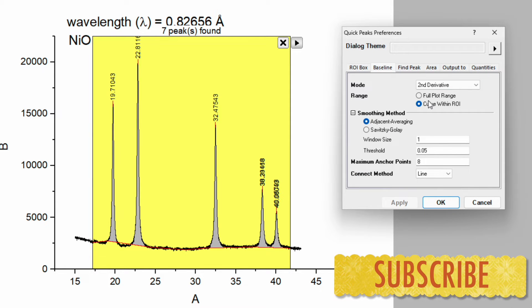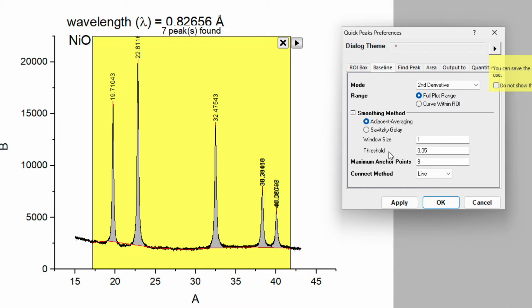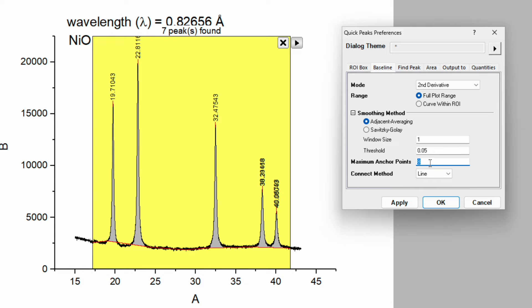In the baseline you can see the different options. Click on the full plot. Then you can see options for threshold and the maximum anchor point. So let's tune this anchor point, change and apply.